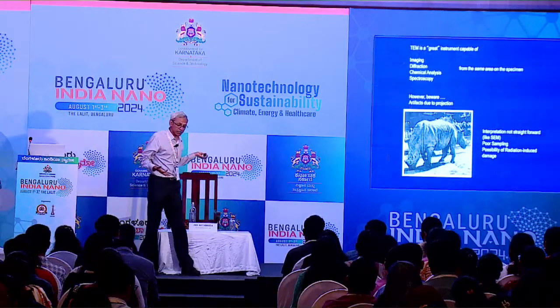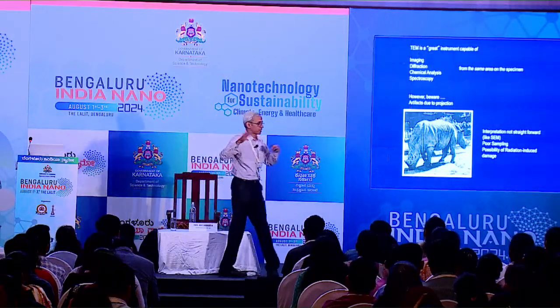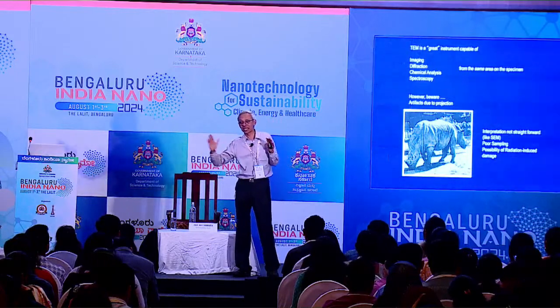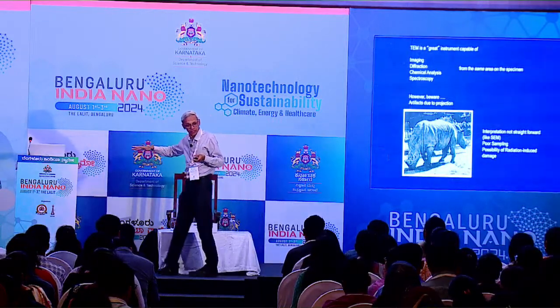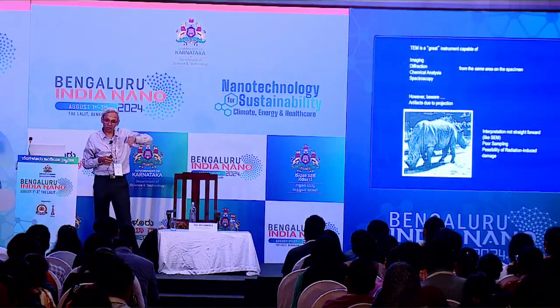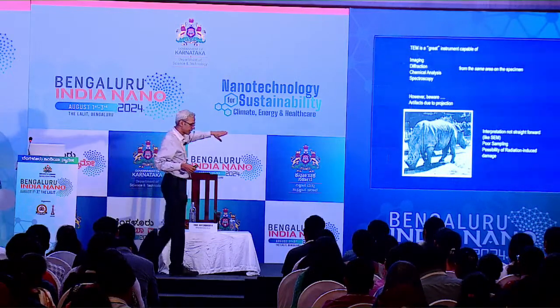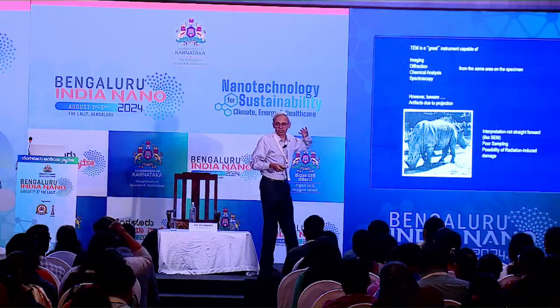This is very similar to what you can get in X-ray photoelectron spectroscopy. We get peaks, for example, 284 point something for carbon and so on. You can get these characteristic peaks of energy loss. When you see a peak at 284, it tells you that carbon is present in the sample because electrons have lost that much energy in causing that kind of an excitation. Okay. Similarly, we can get this energy loss spectroscopy, EELS as it is called.